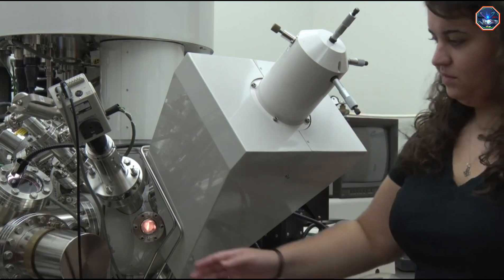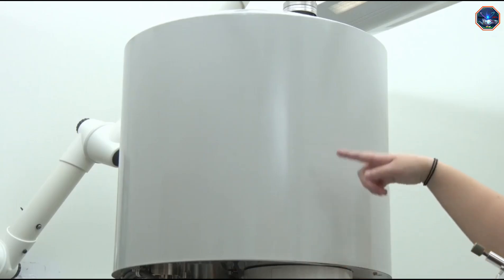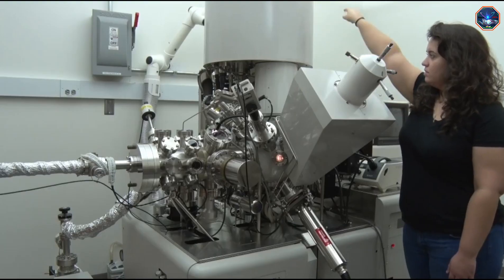The samples sit in the center of this chamber, and the electrons produced travel up through these electron optics through an analyzer which separates them as a function of their energy, and then on to a detector which is on the other side of the chamber.